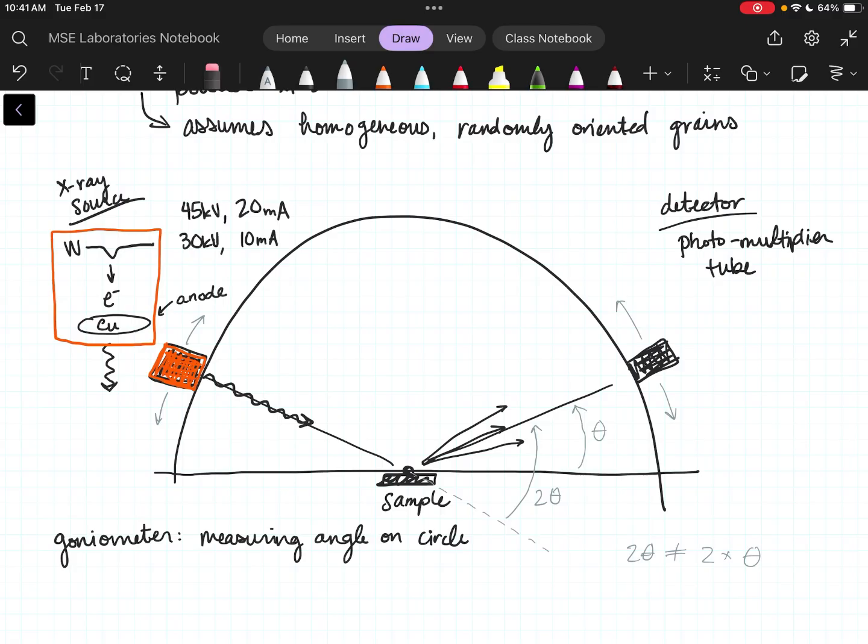That is sort of the simplest and most straightforward orientation of things. And my guess is that's how we did XRD for a really long time. And then my guess is that we expanded and we got more complicated and we figured out new things we could do with it. And we started decoupling these 2 angles to see how that affected the results that we got. But we kept the nomenclature of 2 theta and theta.